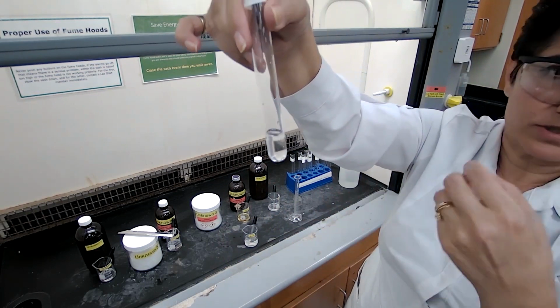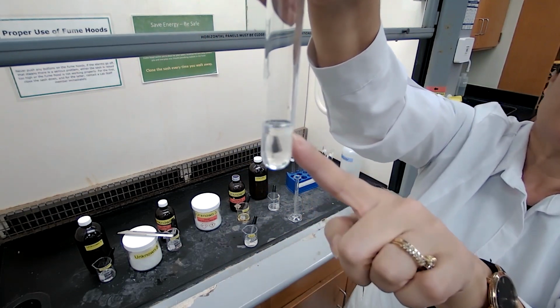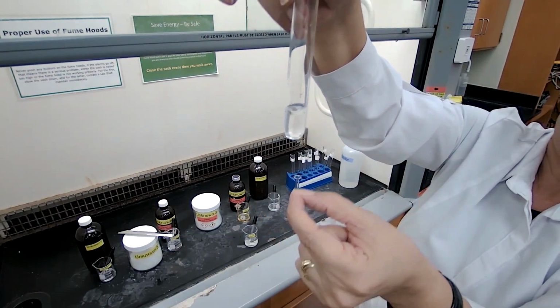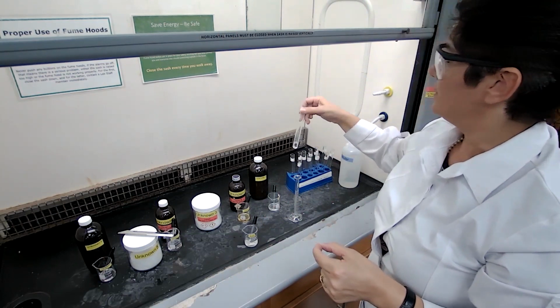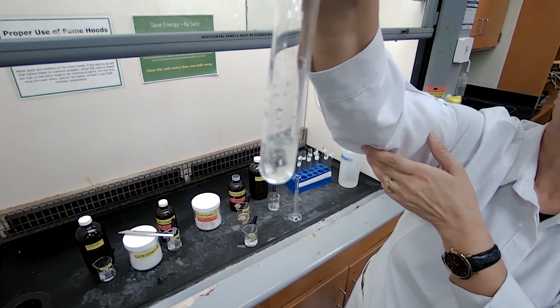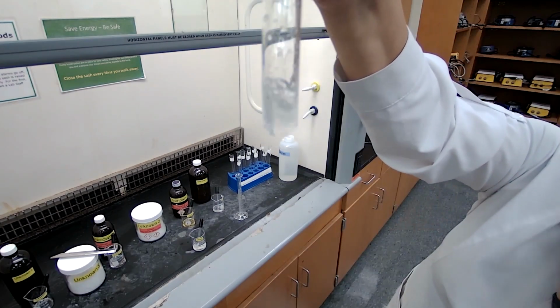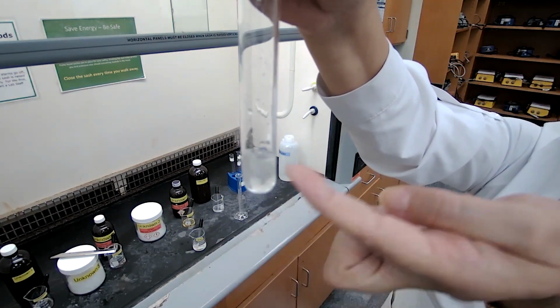You're actually just watching the video and recording the observation. So unknown 1 is not soluble in water. The reason is that a second layer forms, or when I shake it like this, droplets of the oil go into the water and come back up. Unknown 2, you could probably see this also because it's a little bit more colorful than that one. The oil goes down and moves up. See that it's kind of cloudy, and the oil comes down, goes back up.